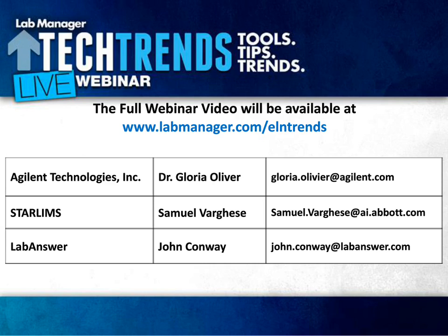Now, how do you evaluate a prototype or a real use scenario prior to choosing an ELN or LIMS vendor? So prototyping is critical. A lot of vendors will come in, they'll do their pre-sales work, and say this does this and that. But until you actually get it in your environment and you're seeing it real time and highlighting major requirements or major issues that are very important to the success of that ELN, you really may not know what the outcome may be.